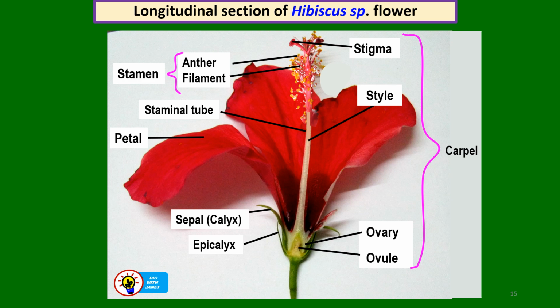Then that is part of the female reproductive structure. So then the stigmas are connected to a style in the center here of this long tube-like structure. Then down here is the ovary, which is a bit swollen. Okay, and then we have the ovules that are like white pearls. Okay, round white pearls inside here, right? That produce a female gamete.